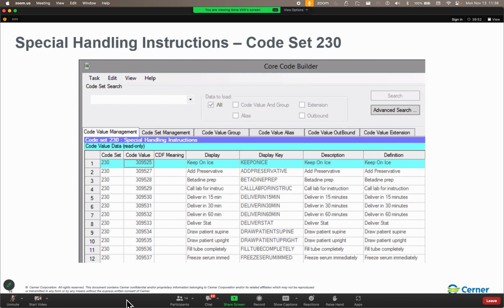I have a question. Yeah. So the site prefixes is a project that we want to start creating at my hospital. Okay. So if you put a default site prefix, we could say like all the outpatient clinics would be 99, and then we have 2 hospital labs, and then we have send-outs and our public health lab because we're county. So can you also assign a default site for Quest and LabCorp?